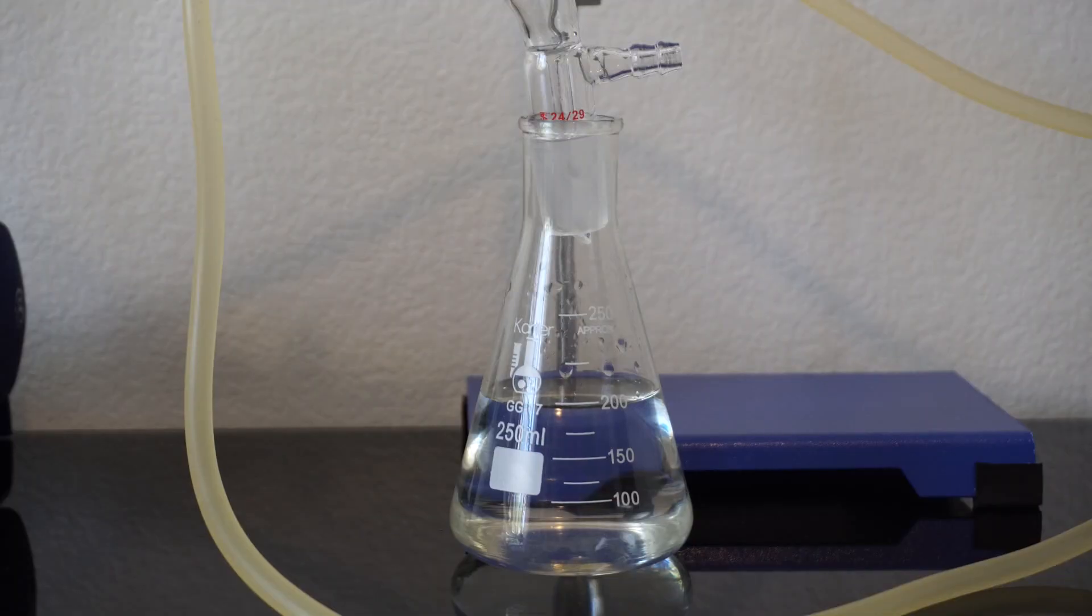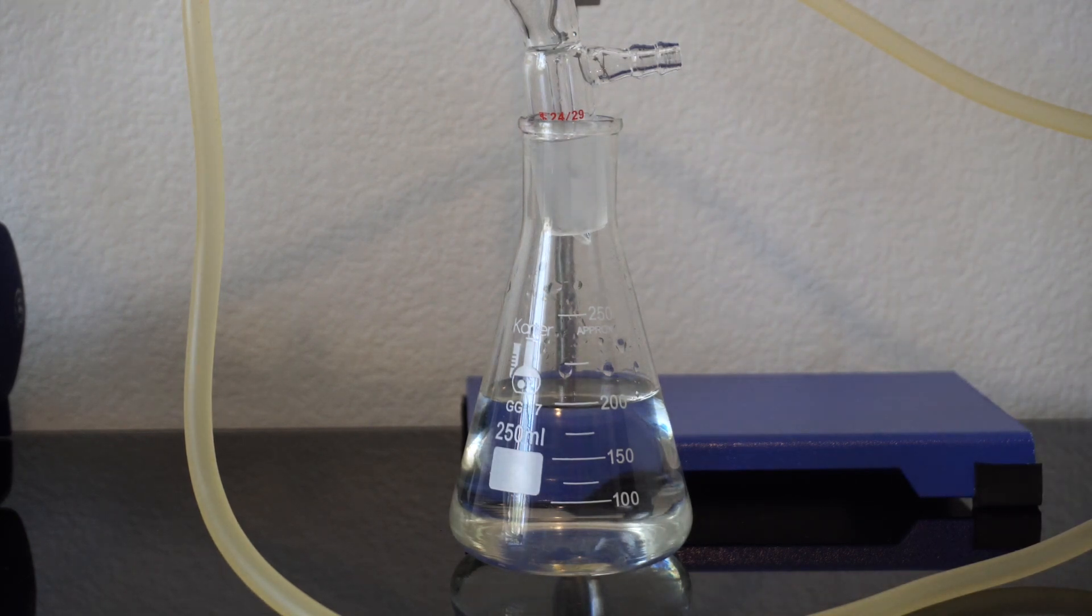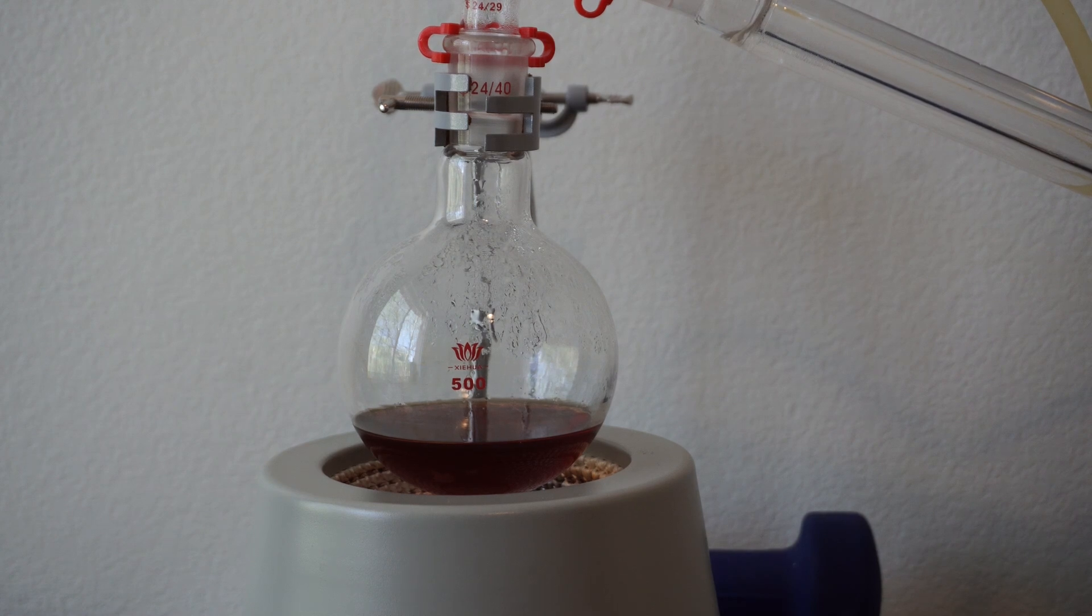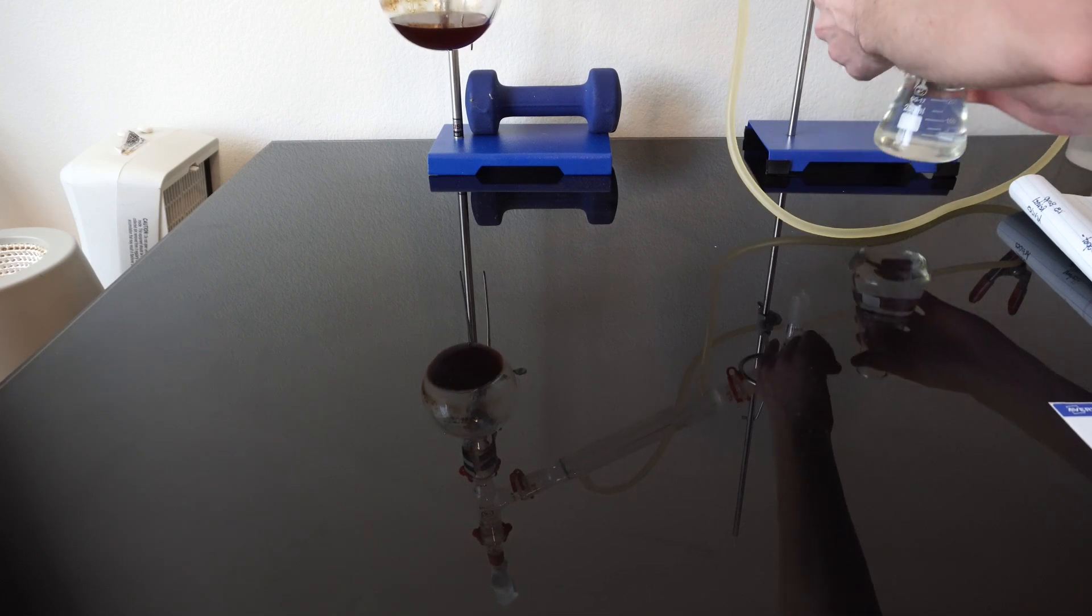When I feel the distillation is complete, we have about 225 milliliters in the receiving flask of rose water, which would leave about 100 milliliters in the boiling flask. We pour the rose water into the labeled container and seal it for future use.